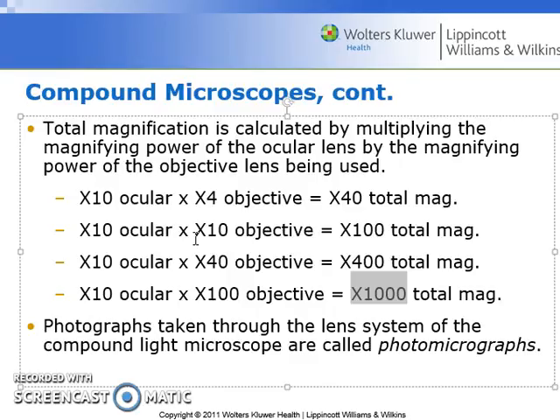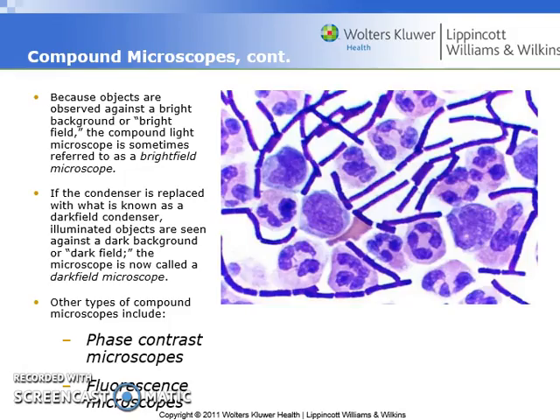because then you can produce what's called photomicrographs, where you essentially have a microscope that can be hooked up to a computer that allows the researcher to take pictures of the bacteria that he or she is viewing under the microscope. So this is a really handy tool to help us further understand and capture those specimens that we're viewing and are interested in studying further. So here's an image here that you can see of an image that was digitally recorded using a microscope.